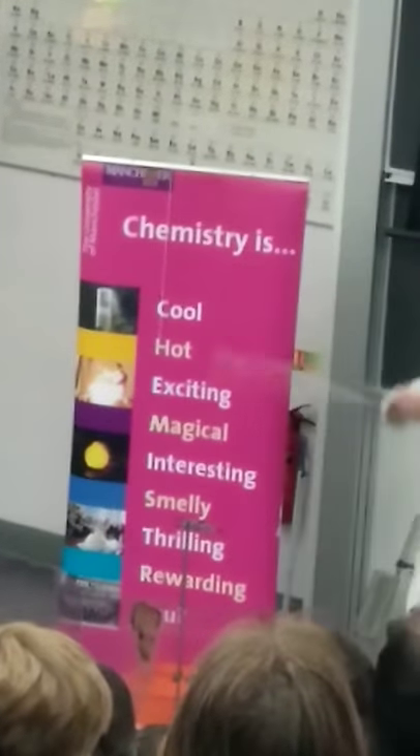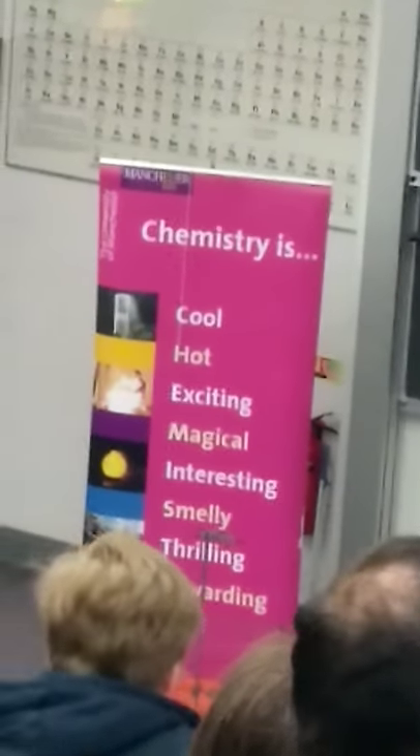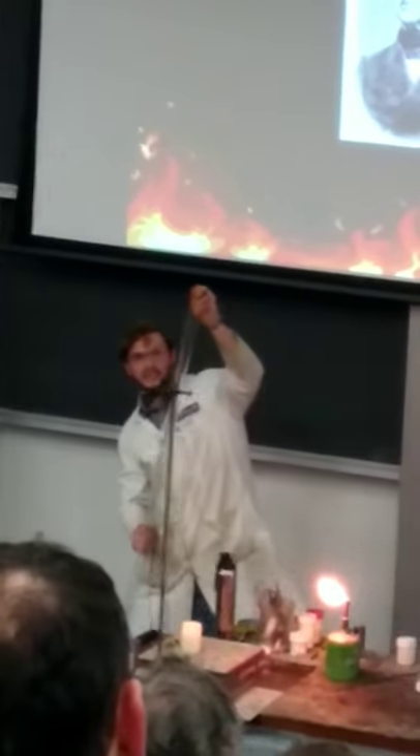For this one, there's a little water in the bottles, if you may have noticed. We have to invert this tube several times, because if anyone can see an orange gas produced, that is NO2.